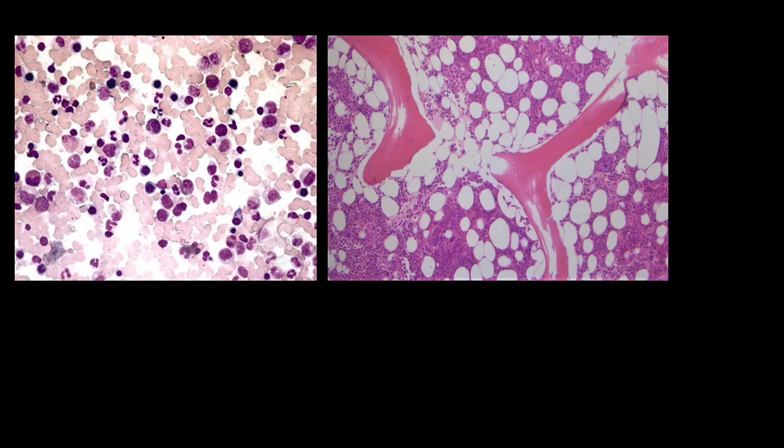In bone marrow aspirate, you can appreciate the detailed morphology of individual cells, while in bone marrow trefine biopsy, you can assess the bone marrow architecture and cellularity.